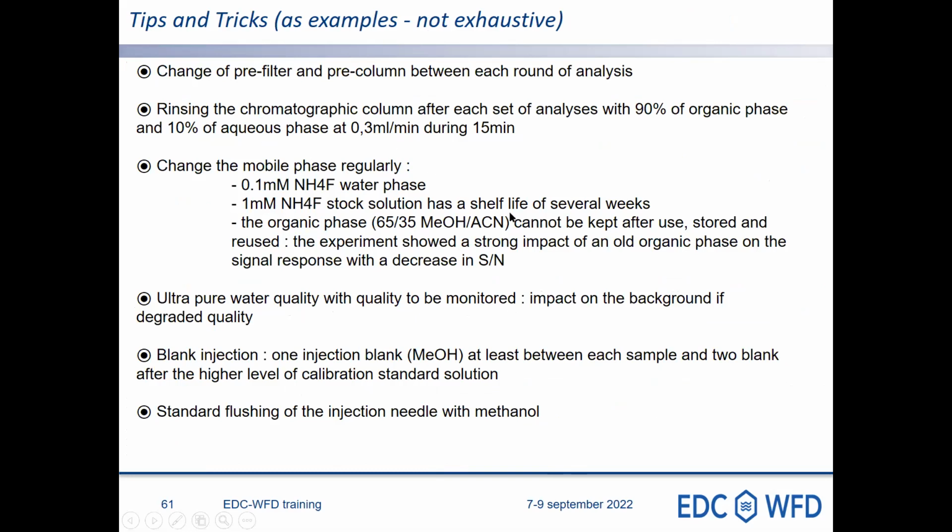So what are our key messages? It's not exhaustive, but this is a first set of key messages. Changing the pre-filter and pre-column between each round of analysis is our recommendation. Having a very cautious cleaning of the system is really the basis. Rinsing the chromatographic column after each set of analyses with 90% organic phase and 10% aqueous phase is really a recommendation. Change the mobile phase regularly, and do it preventively, not waiting, is also our key message.